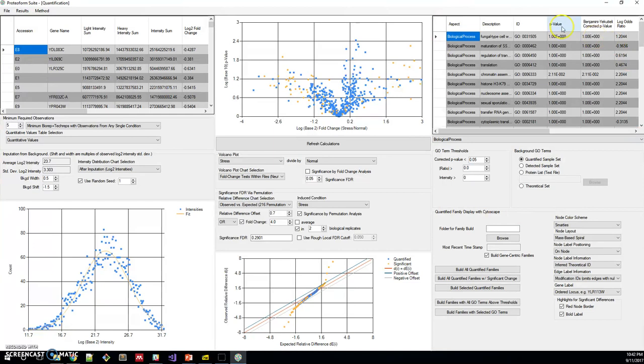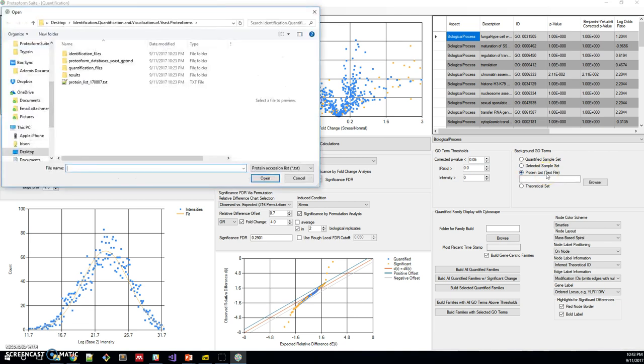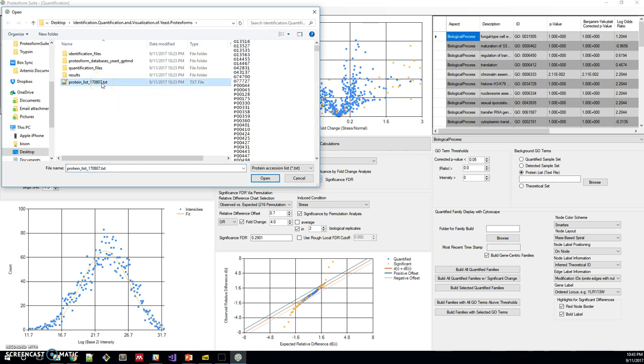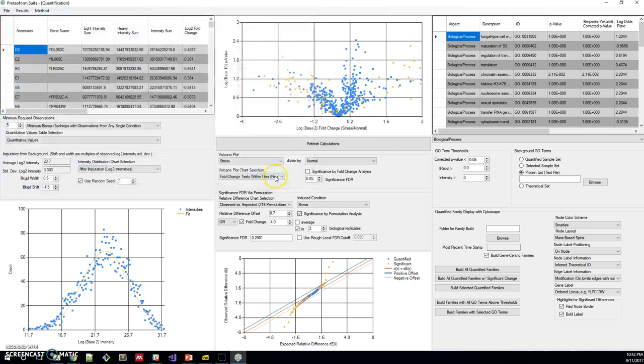You can either choose to use the quantified sample set as quantified proteoforms as the background set for GO-analysis, or you can choose, in this case I'll show you how to use a custom protein list. This protein list are the proteins that were identified in the bottom-up experiment. You can load these in as a background for the GO-analysis.